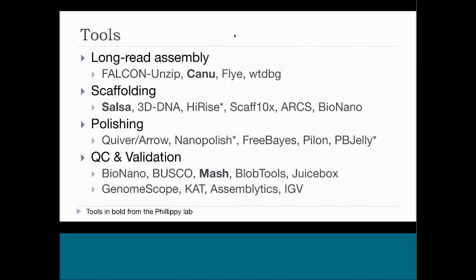To look for potential contamination, you can essentially just treat it like a metagenome and use tools developed for metagenome classification to try and classify the Illumina reads. So something like Kraken or our MASH tool, which has a screen functionality, can take an Illumina data set and very rapidly tell you if it looks like there is high coverage from known reference genomes in your Illumina data set.